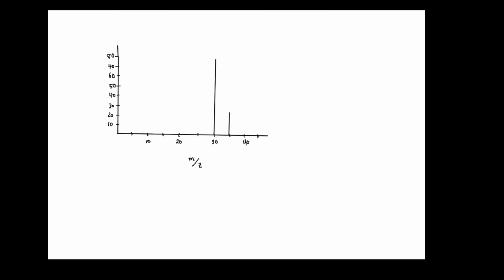Now, again, what I want to remind you about here is that I have eliminated the peaks that we would have for the Cl2. They're not in here because I want to keep this as simple as possible. And I see that I made a mistake here. Let me get rid of this very quickly and I'll redraw it.